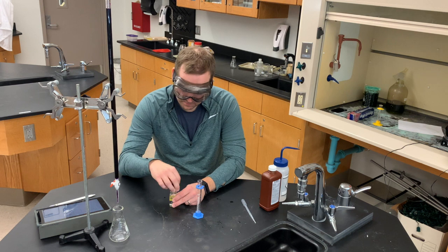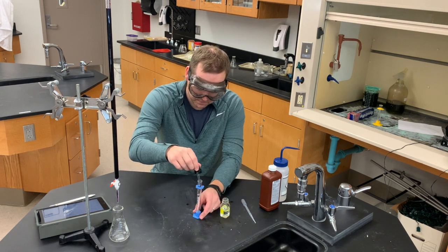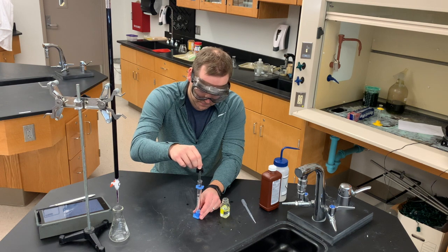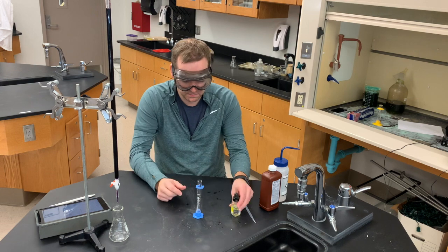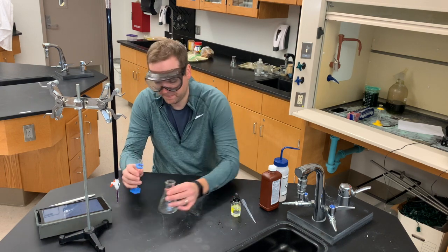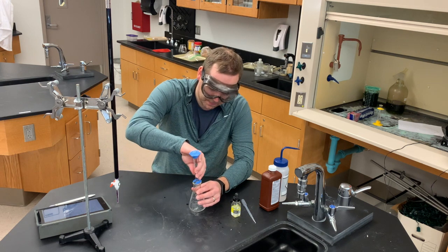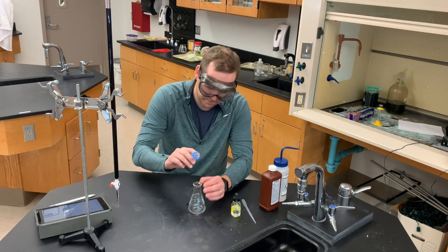Next I'm going to take the three molar acid and add one and a half to two squirts into the analyte — the hydrogen peroxide — to ensure that the experiment is carried out in acidic conditions. Give it a little swirl and transfer it to this Erlenmeyer flask to get ready for the titration, making sure I get every last drop out.